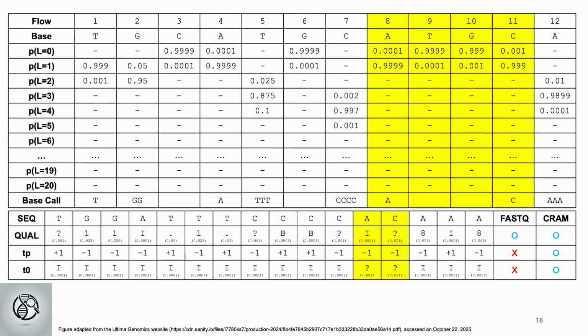Flows 9 and 10 are both zeromers, while flows 8 and 11 each have a T0 value of 0.001. Since flow 10 was a zeromer, its 0.001 error probability couldn't be encoded within the flow, so it's recorded in the neighboring flows instead.